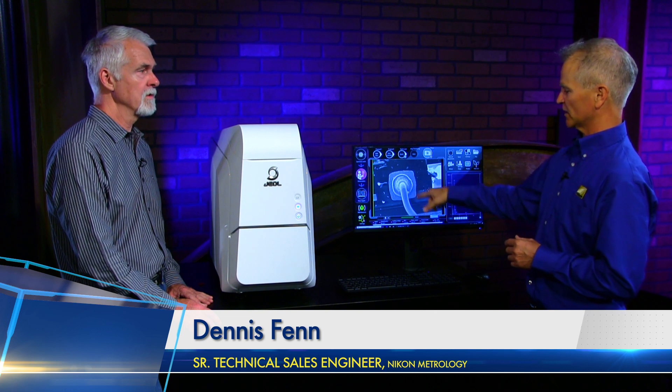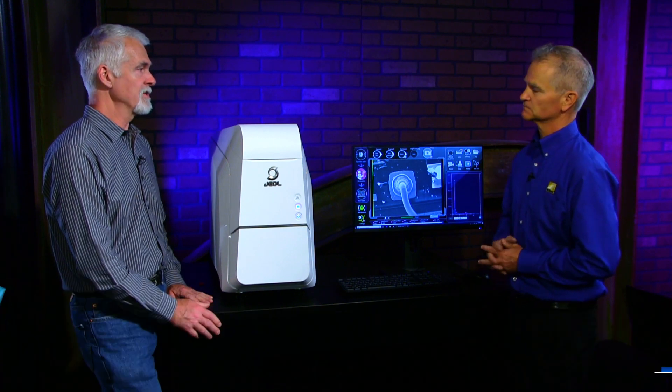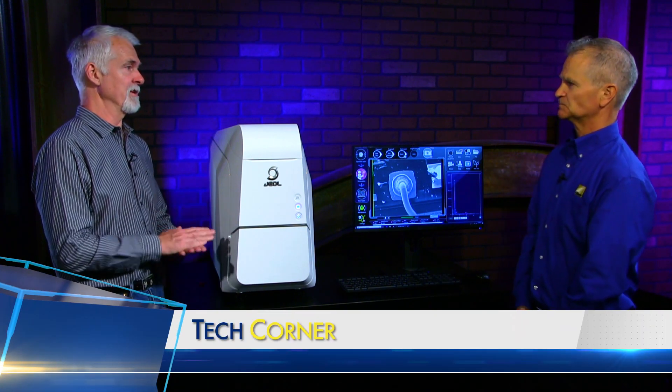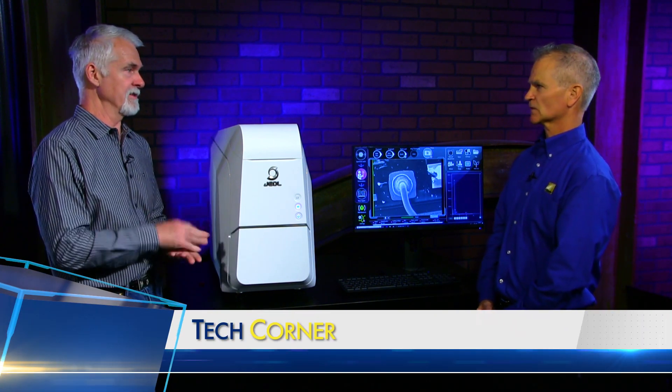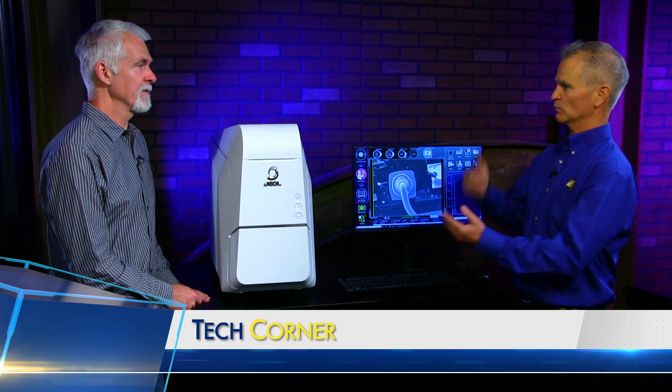You also get the capability of a large depth of focus with an SEM, so everything in the foreground and the background is all in focus in one image. You can see that right here — I have a bond wire coming over that's above that pad and everything here is in focus. Unlike an optical system with a focal length, this is basically infinite focus. With an optical microscope, you get a very narrow focus band and everything above and below is out of focus.